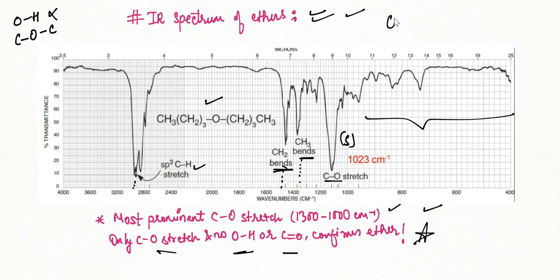So we might think that the data for the ether is very less. But guys, when there is an oxygen, let's say we are having a molecular formula like C2H6O, and you have to determine the structure. If you are not having a carbonyl frequency around 1700, no carbonyl. If you are not having a broad peak, then there is no OH group either. So definitely, for one oxygen it has to be ether, isn't it? And we can confirm that by the CH3 bending and stretching vibrations and so on. Alright, so I hope that this was clear to you.